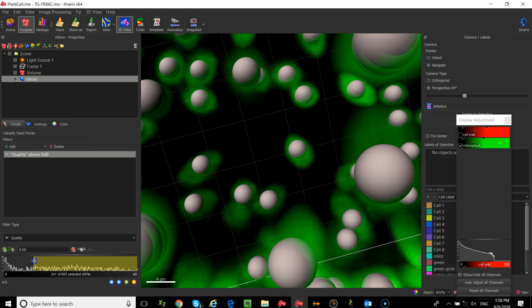So the problem here is that this sphere is overlapping with the edge of the other object. When you have a peak intensity, we're actually looking for a drop, so we can tell where that split is going to occur. If the sphere is too big and covers that drop in intensity, it won't be able to place another sphere next to it.